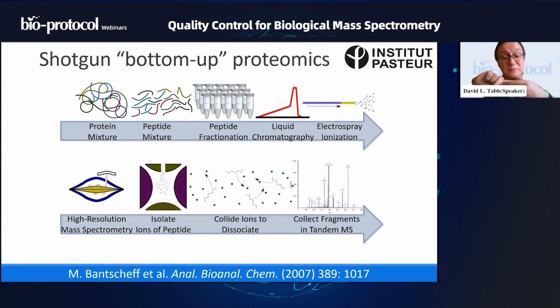having some disulfide bonds, holding links in place and holding folds together just so. And so proteins are already kind of inconvenient for us to deal with from an analytical chemistry point of view. So we're going to want to cut them up into peptides, but we can't really do that until we can denature them, until we can make these complex structures unfold into kind of a loose chain. That means we're going to need to reduce disulfide bridges, probably hit it with something like urea to make it stretch out nicely, and then chop it with something like trypsin.